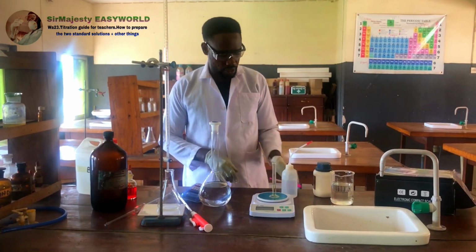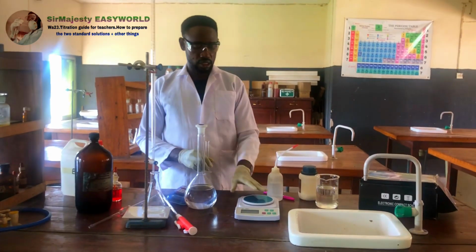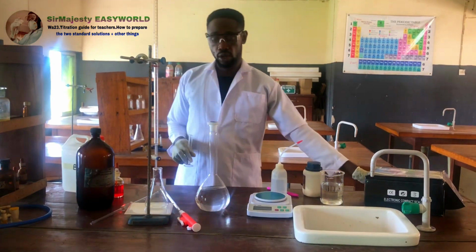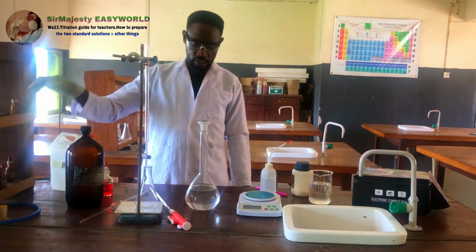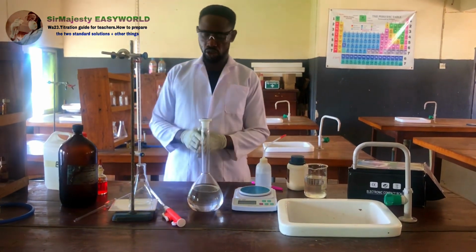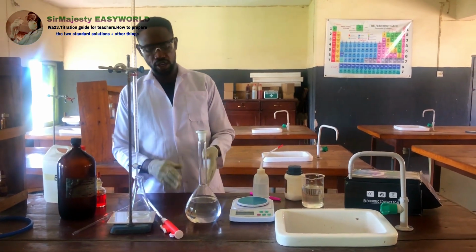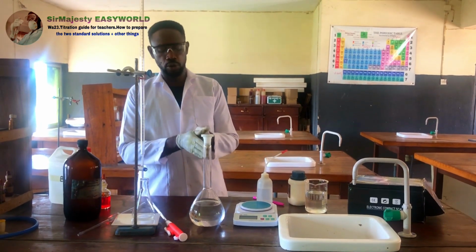So at least we have learned how to calculate or determine the specific gravity of acids. This is also applicable to other acids apart from HCl. Now, the next thing is we go back to the instruction. The instruction says measure 8.5 and then dissolve in 1000, meaning solution A will contain 8.5 cm3 of concentrated HCl per 1 dm cube of solution.